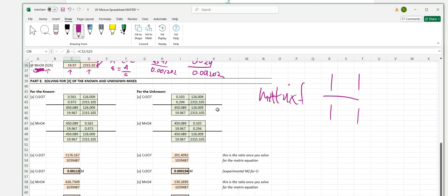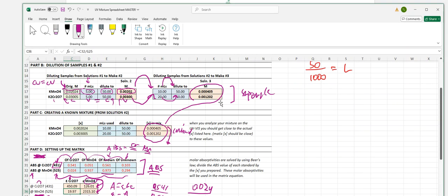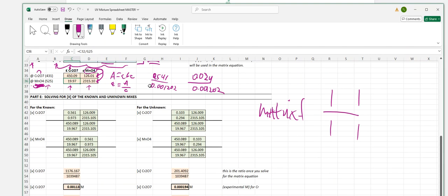So in order to do this, in the molar absorptivity absorbance realm, you saw a lot of these example matrix problems, right? You saw that. We did some lecture videos about it. It was in the playlist. You probably watched it. At least I hope you did. But that gave you some examples on how to set up a matrix and how to solve it the proper way. So this table down here at the bottom is going to be divided up into two halves.